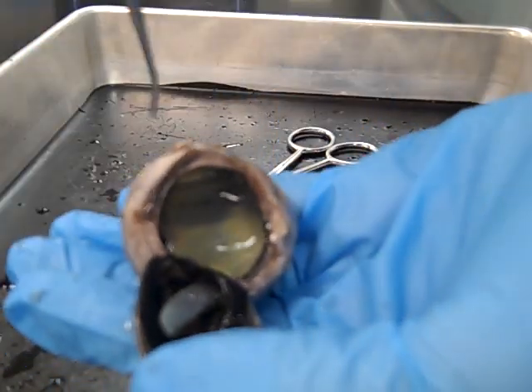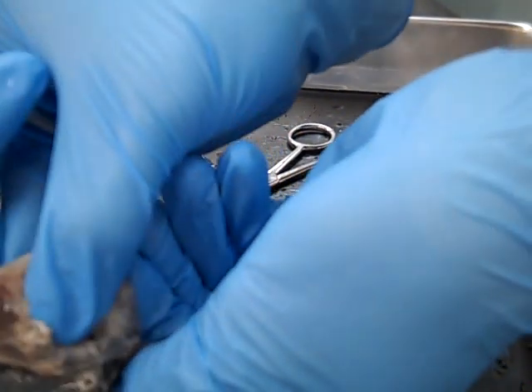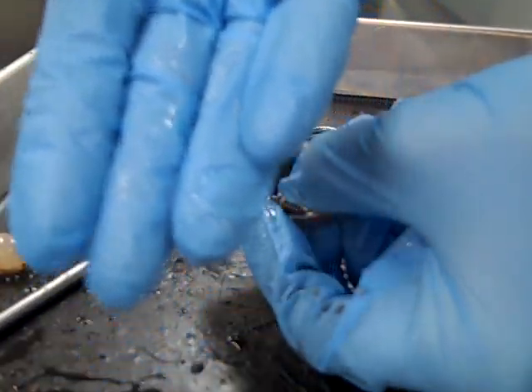This is the rest of the eye. Notice it is full of this jelly-like vitreous humor. We need to squeeze some of that out before we can continue with our cut.